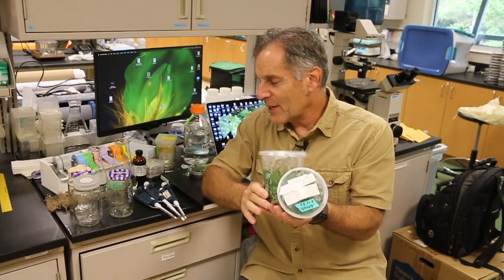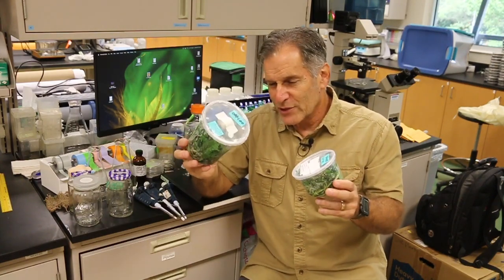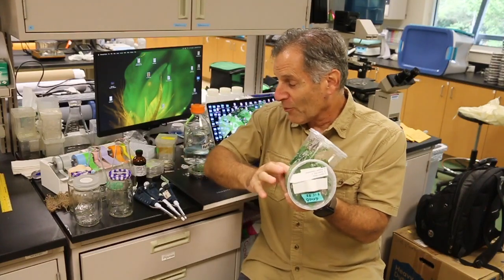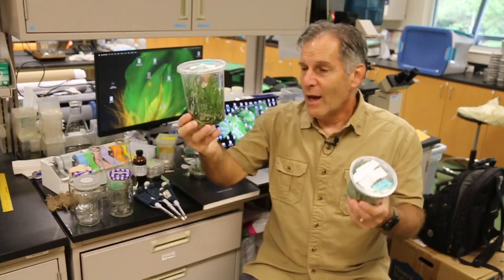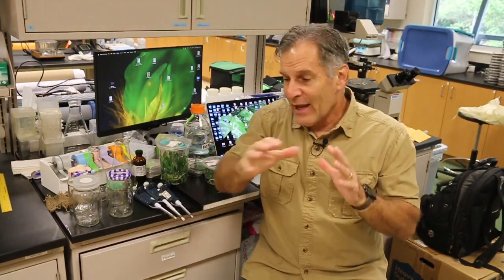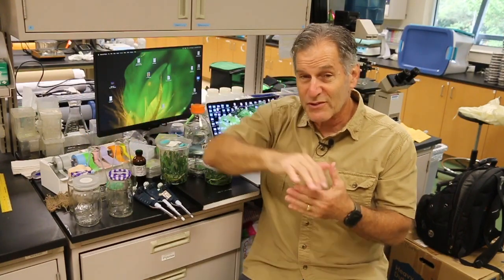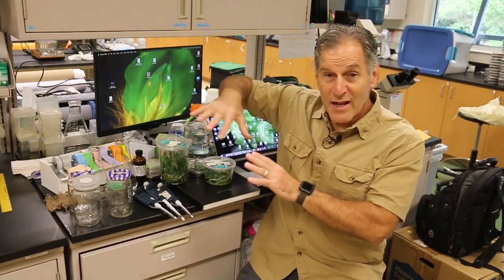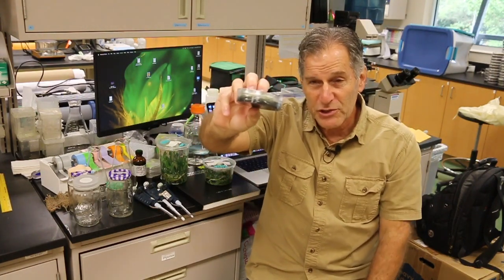These are light containers. It's much easier to transport and ship these larger containers. The orchids get really big. They can get really big, as you can tell, in this container. I started out using these types of containers, and now everything is in petri dishes, and these are tall petri dishes.